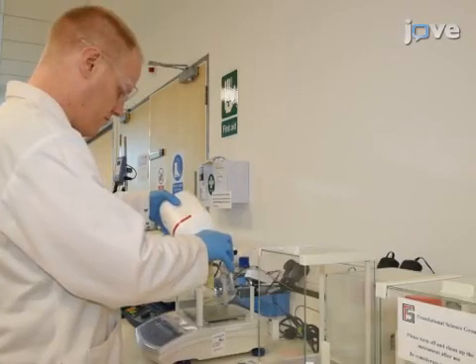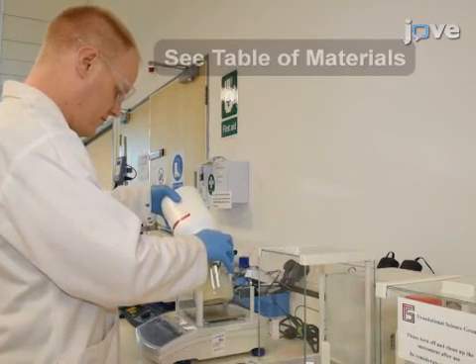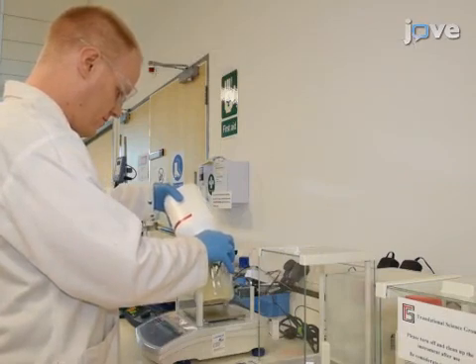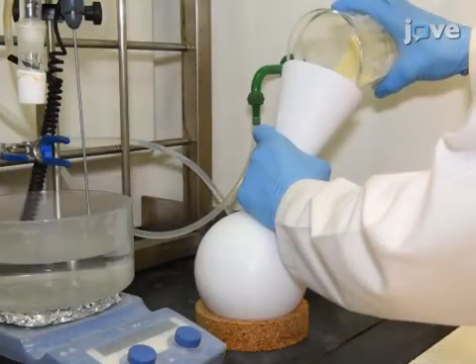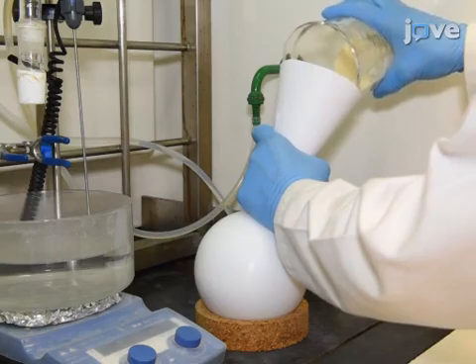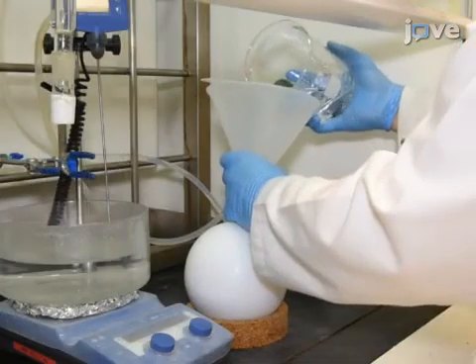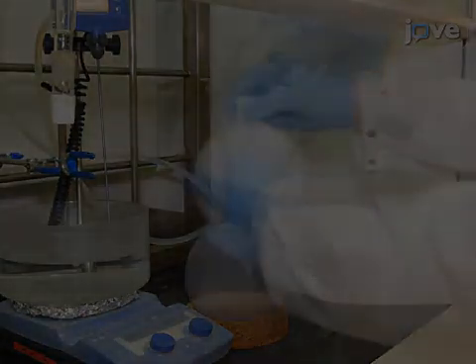Carefully weigh 100 grams of L-Clavatam spores without creating dust and away from any ignition source. Then slowly transfer the spores to a 1-liter PTFE round-bottom flask with a magnetic stirring rod. Add 500 milliliters of acetone to the spores and shake the flask gently.